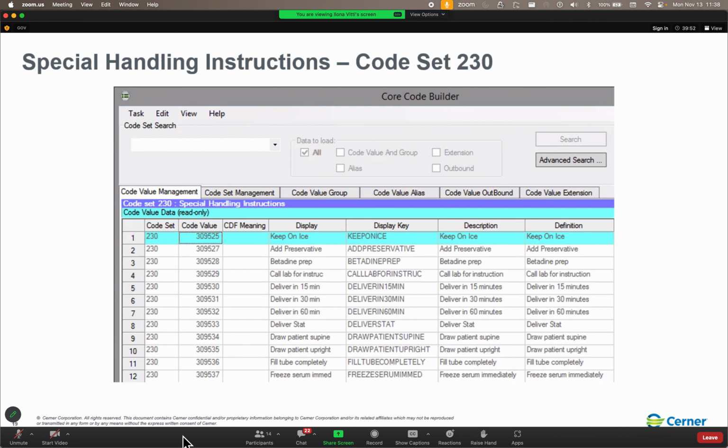Okay. So that's how it's stored on the back end. So we're not adding this sequence length to that sequence length. All that is determining is what our last set of numbers is, and do we need to pad the left-hand side with any extra zeros? Does that help clarify? Yes, that was, thank you. And we actually will go through that as an activity in CCL on Thursday morning. So this will come back again. All right, folks, what other questions do you have?